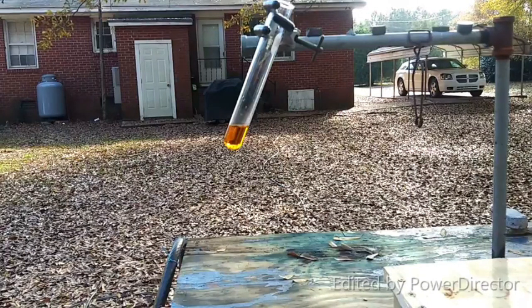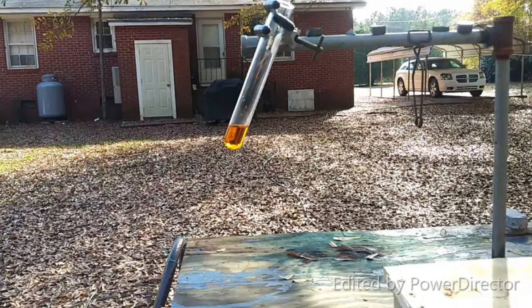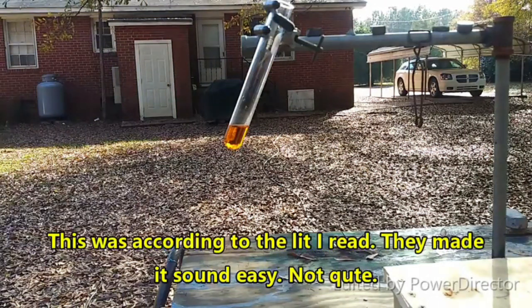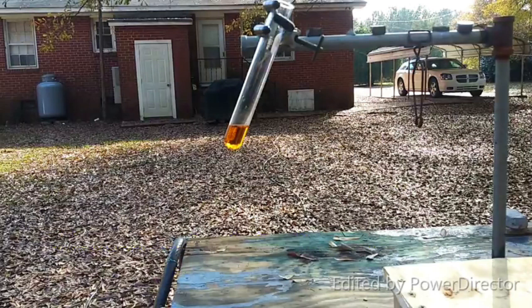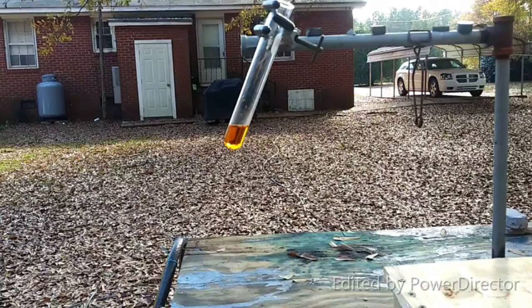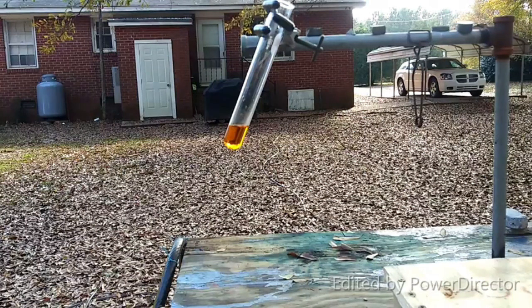However, if you reduce it with hydrogen gas at 100°C, you will produce platinum black, which is an incredibly fine suspension of platinum, well, basically in solution. It's much, much more reactive than some of the other, larger particle solid forms of metallic platinum. So anyway, we're going to make that because that sounds much more cool.